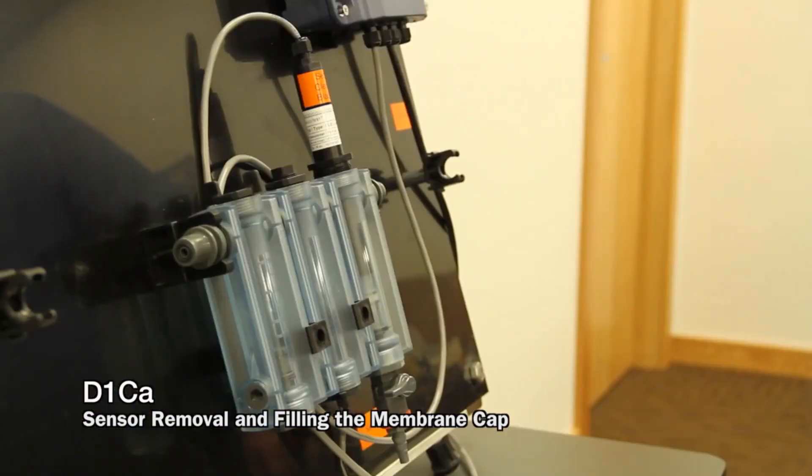After changing the electrolyte, or if you first installed the electrolyte, it takes several hours to get a true reading before you want to perform your calibration.